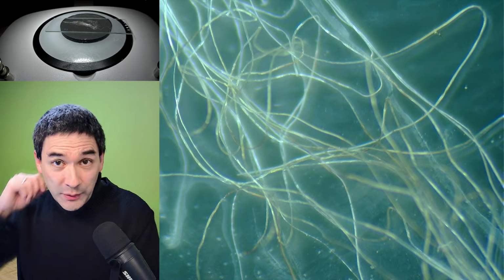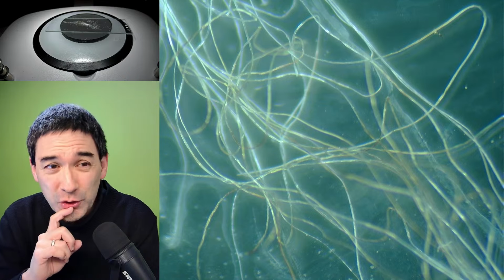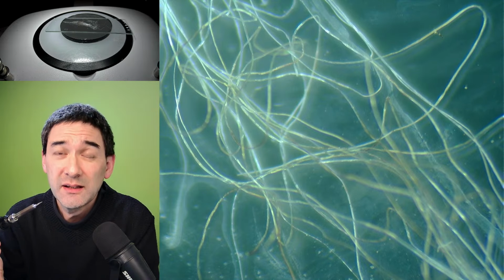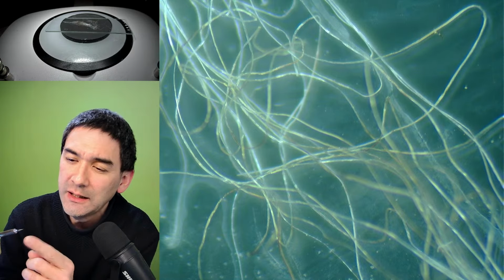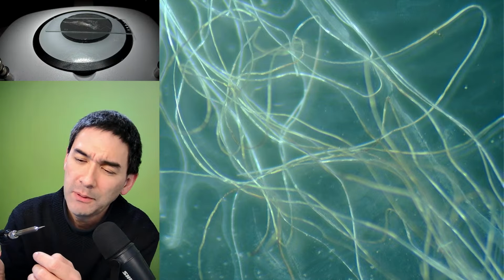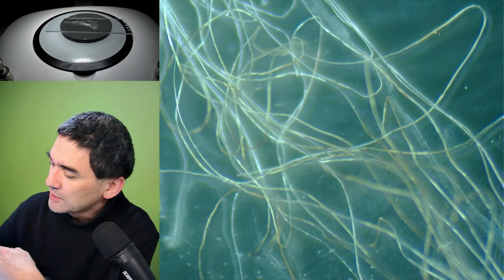And I've tried doing this also with real individual fibers that I found. This also kind of works, but the difficulty is that the tip itself is not fine enough, even though it's quite pointed. So I was thinking maybe I could somehow connect a needle or a pin to the tip of the soldering iron, but I wouldn't know how to do that. Maybe with a little bit of wire or something. But let's try now a different one. So these were basically cellulose fibers.